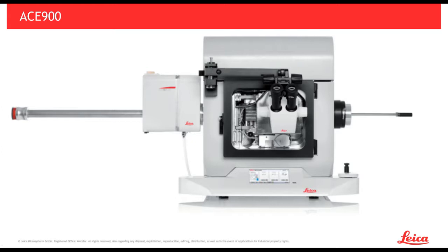The formation of crystalline PTC replicas seems to be an unusual feature of the ACE 900, which is, of course, not desirable. This is not observed in other freeze fracture machines. Have you studied the techniques of John Rash to get a high level of detail from the PTC freeze fracture replicas? And could these methods or hardware modifications be implemented in your hardware?